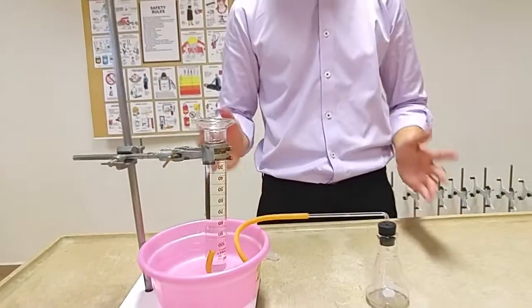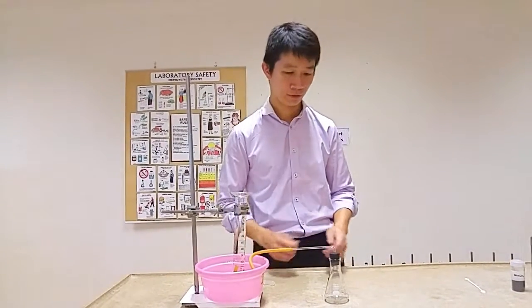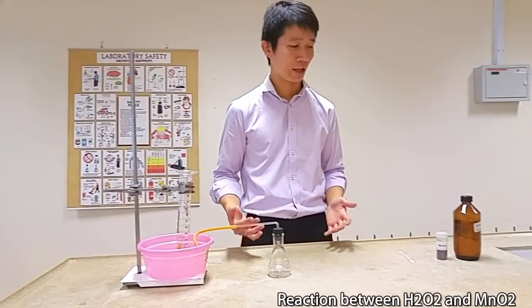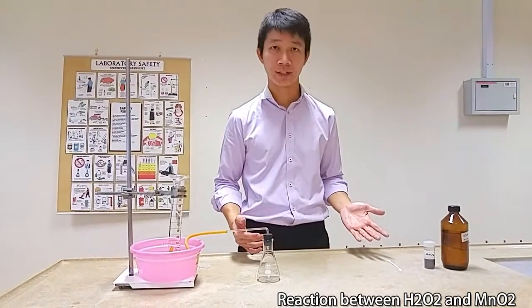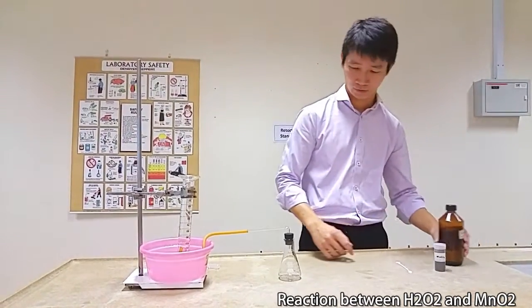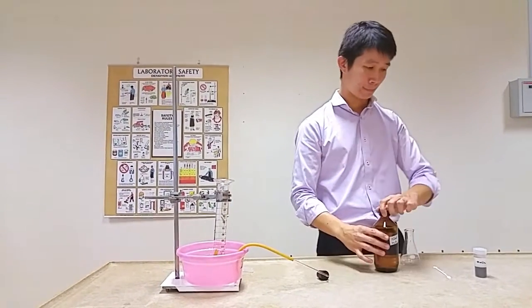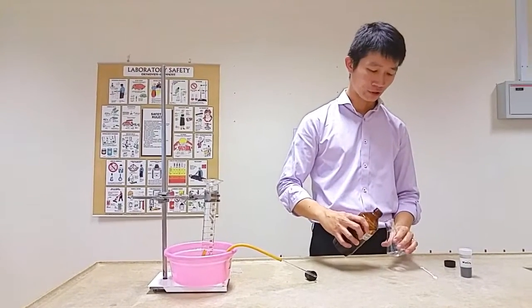Once this is all done, you are ready to commence your experiment to collect the gas. For this experiment, we will be doing a gas collection for the reaction between hydrogen peroxide and manganese dioxide catalyst. Measure the suitable amount of hydrogen peroxide.